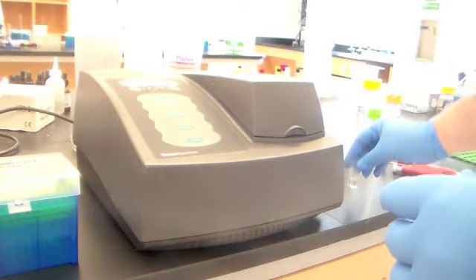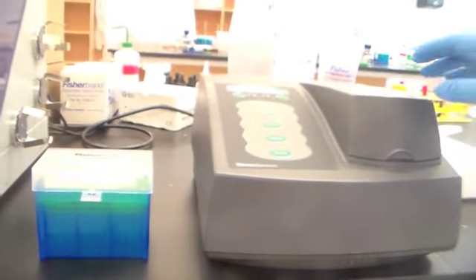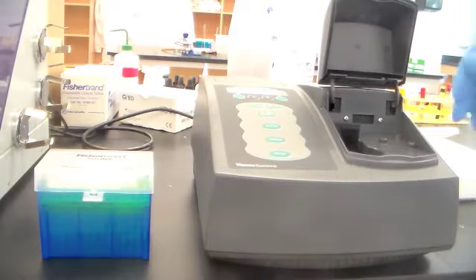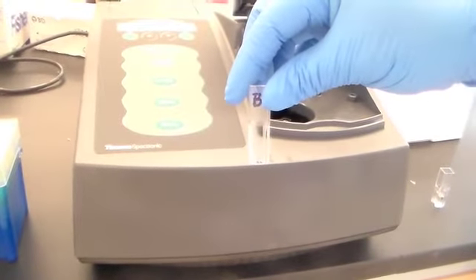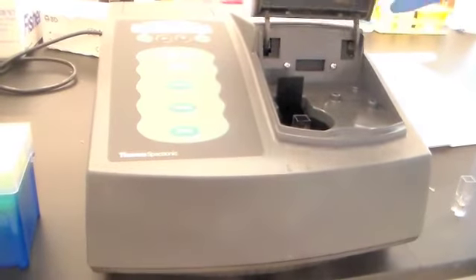You're next going to use, so this is my sample, this is the spectrophotometer. It's set to 600 nanometers wavelength, so it's passing a light beam through a chamber at 600 nanometers. I have a blank, so this is a cuvette that has the sterile media that the E. coli is growing in, but no E. coli have been put in here. We're first going to blank the machine so that if there is any innate absorbance to that M9 minimal media, we can tell the machine that it's 0.